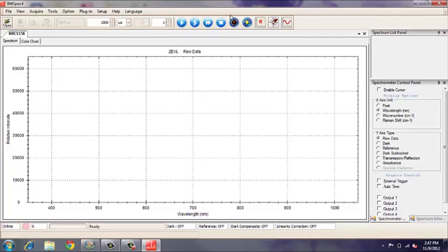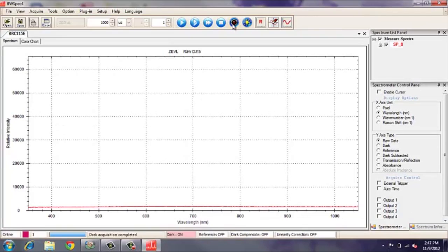What I'm going to do first is take a basic dark spectrum. Every spectrometer has a detector made up of a number of pixels which collect the photons. Even in the dark state, there is some amount of residual dark current or dark charge, and this might interfere with your actual reading. So we collect a dark spectrum, save it, and subtract it from the actual reading.